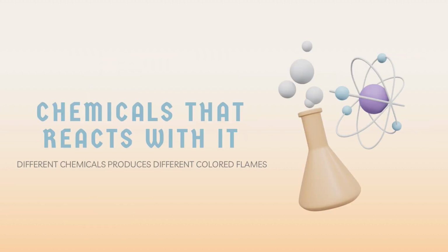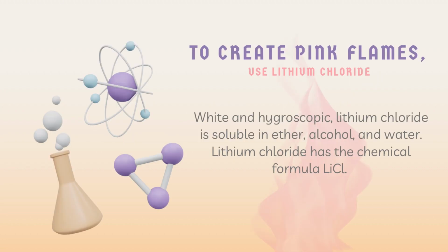Now here's the fun part. Different chemicals produce different colors. To create pink flames, use lithium chloride. White and hygroscopic, lithium chloride is soluble in ether, alcohol, and water. It has a chemical formula, LiCl.